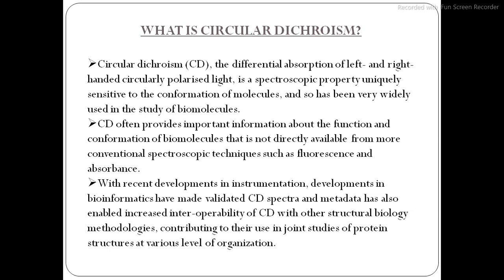Circular dichroism is often used for protein structure determination, induced structural changes, that is pH, heat and solvent, protein folding and unfolding, mutation in protein sample, ligand binding, structural aspects of nucleic acid, polysaccharides, peptides, hormones, and other molecules.